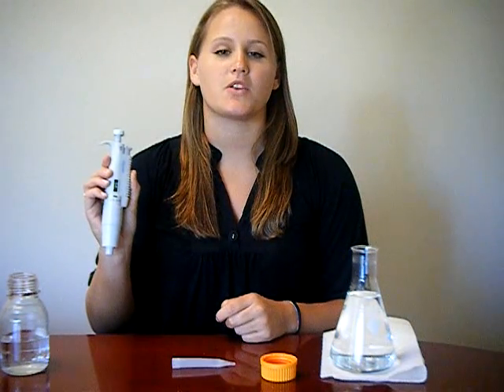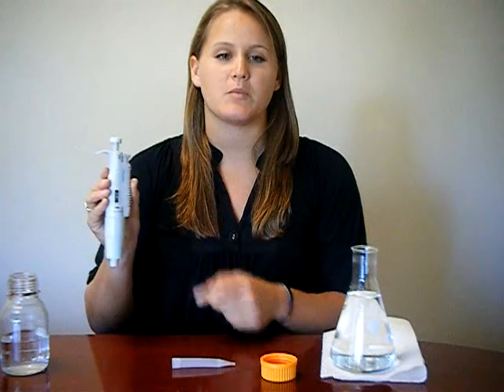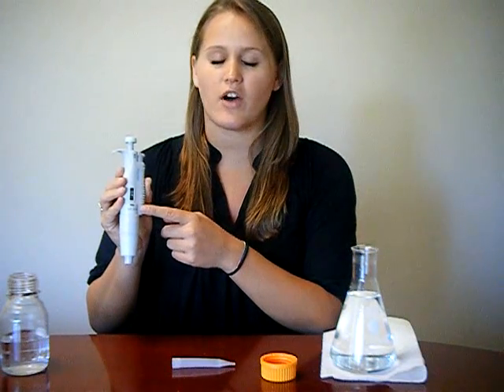In today's module we will be discussing micropipetting. Pipets are commonly labeled with their volume threshold. This pipet is able to carry 500 microliters to 5 milliliters.